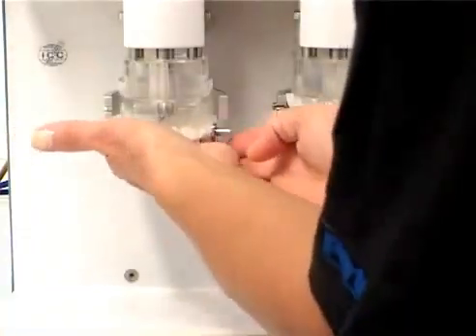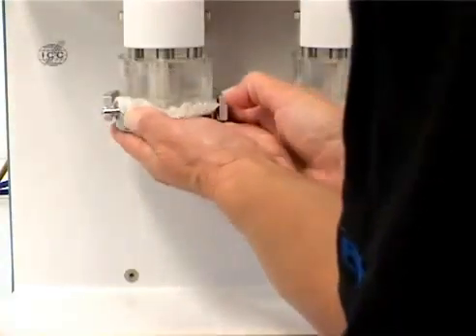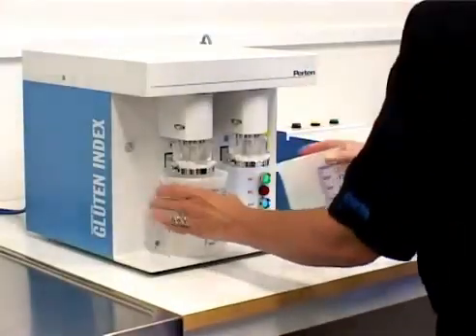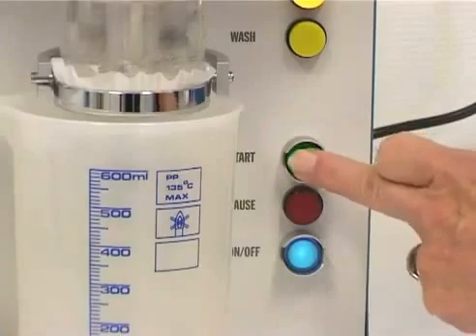Place each wash chamber in its position on the Glutomatic and the collecting cups under the wash chambers. Press start.